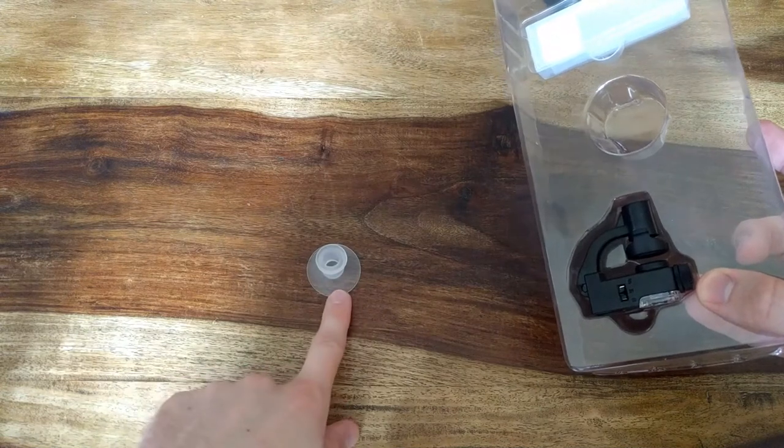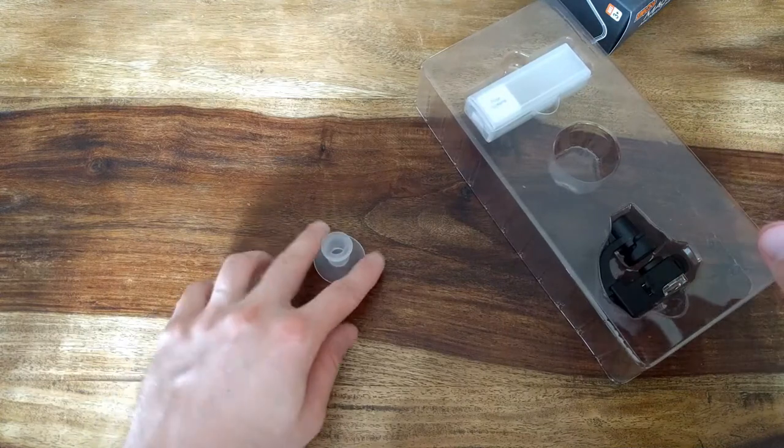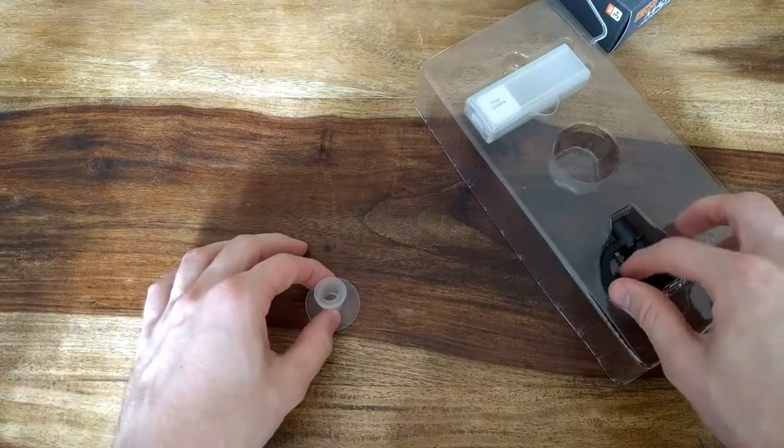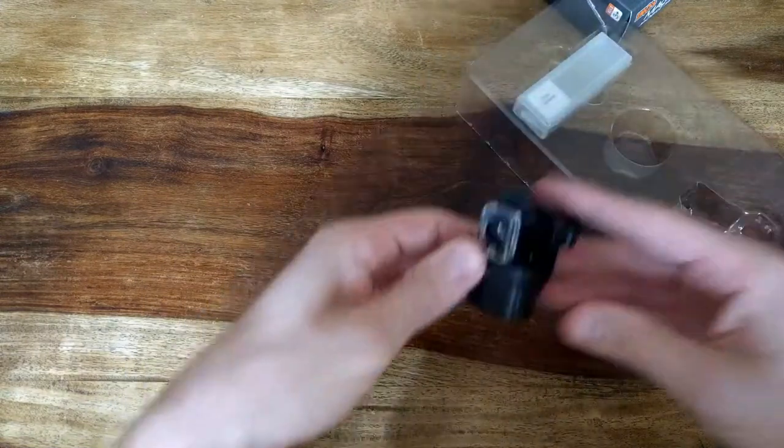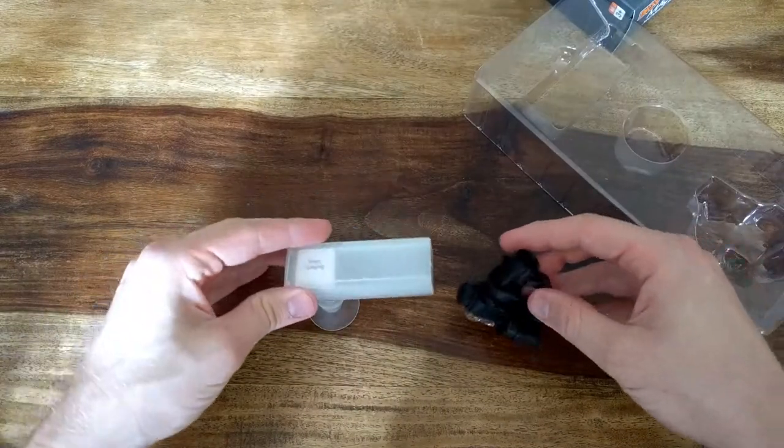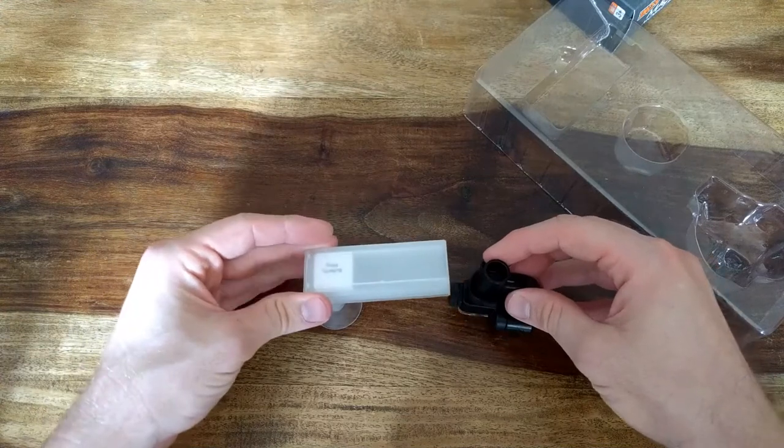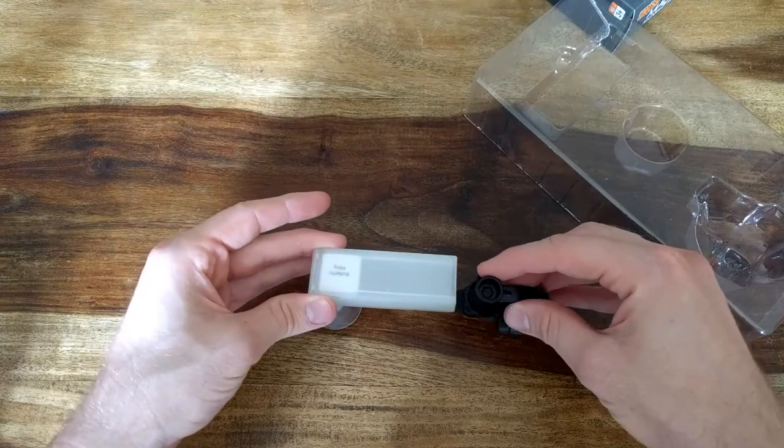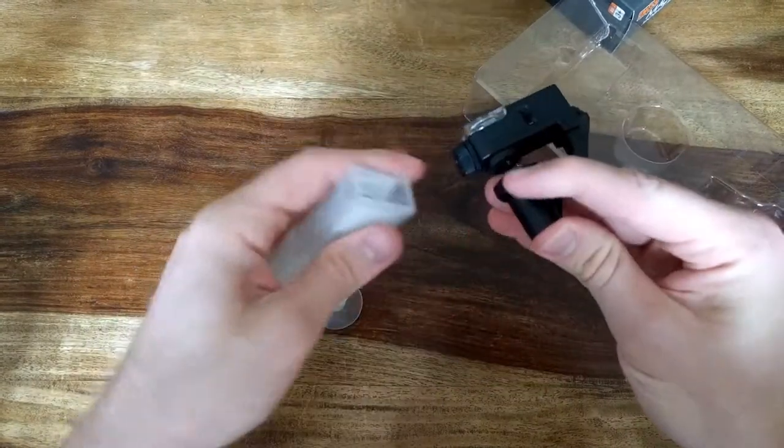I don't have another phone; I'm filming with my current phone. The idea is you're putting the stabilizer, putting the microscope on your phone and just using it. The idea is you're putting the phone on the stabilizer in order for it to be parallel to the ground and for you not to hold it.